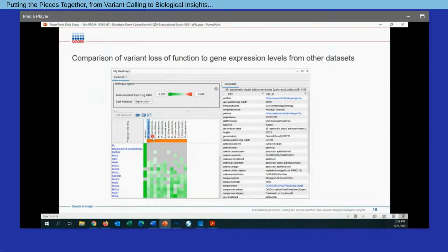And the studies that are specifically within this heat map represent those studies in which we see at the gene expression level a similar subset of this set of genes in my loss of function study that show a decrease in expression that would have a similar kind of activity impact as our loss of function variants. And we can interrogate the contextual details of all these different public studies to understand, where else is this signature of loss of function identified across a large spectrum of different public studies related to cancer.